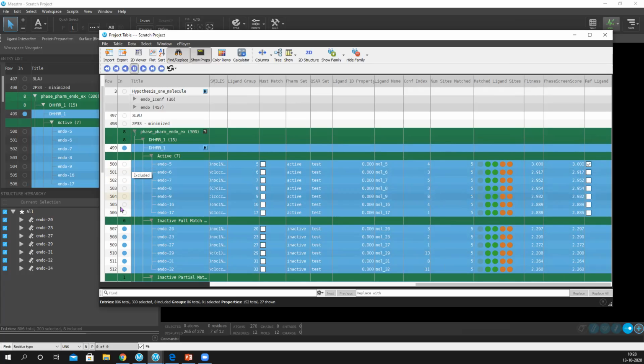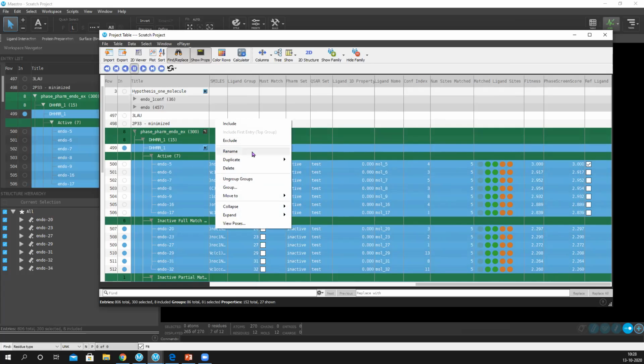It is very well suited with the active molecules, but it's a bad signal that it is nicely aligned with your inactive molecules also. Okay, so now you need to select this and I will open all of them. We need to search for those set of molecules where the pharmacophore is not matching well with inactive molecules and matching well with active molecules, whatever is possible. So I'll expand this group.